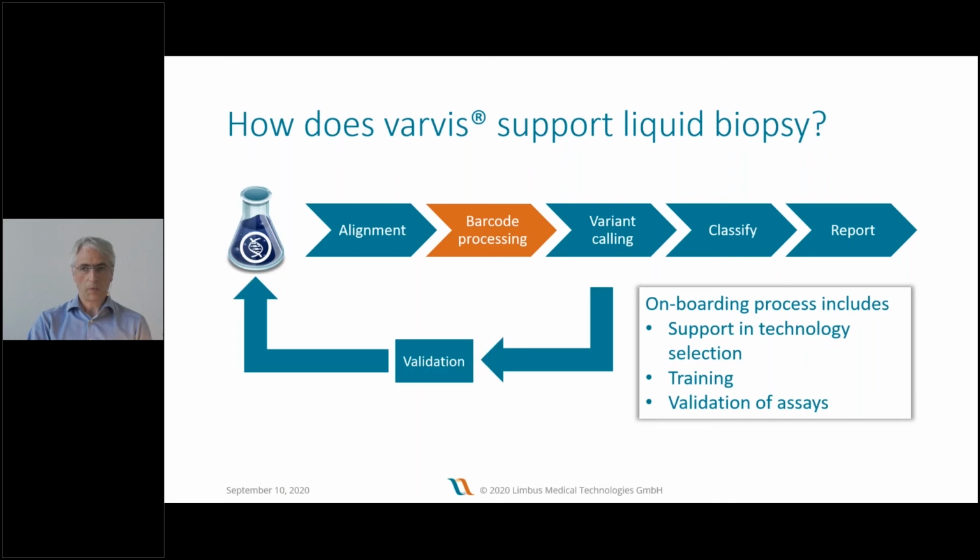The validation is performed by comparing the output of the data analysis to the known and published reference data when our customers are sequencing reference materials. And I think everyone who's performed validation of NGS assays knows how much work and effort can be involved in this kind of process.